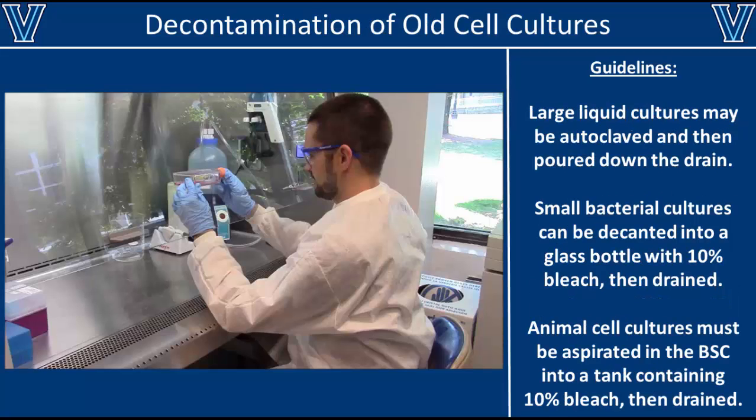If you ever work with any cells, you'll have to properly dispose of them as soon as you're done with your experiment. Please try to dispose of old cell cultures as soon as possible to prevent them from building up in the lab and providing breeding grounds for other types of contaminants.